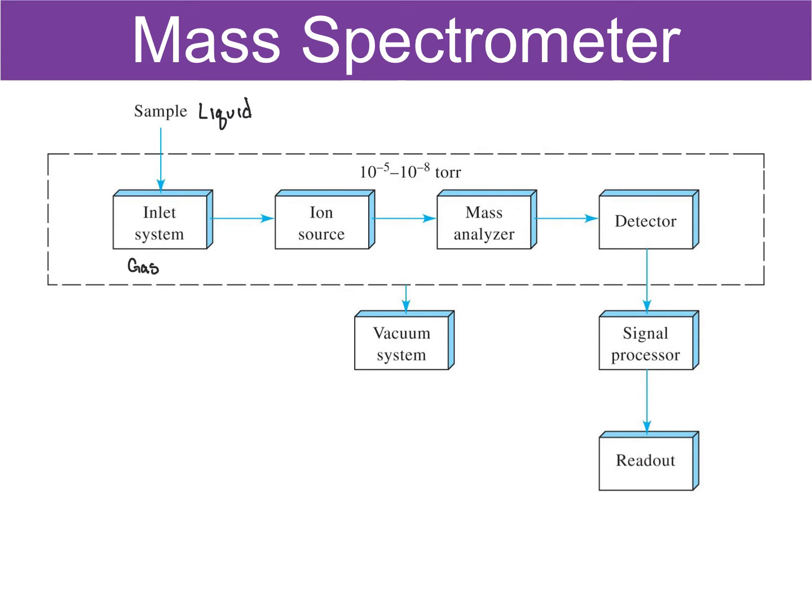And so that means that we're injecting very small amounts. And there are mass specs that allow you to inject solids, but no matter what the approach, it must be turned into a gas very quickly. We have to keep our sample as a gas.